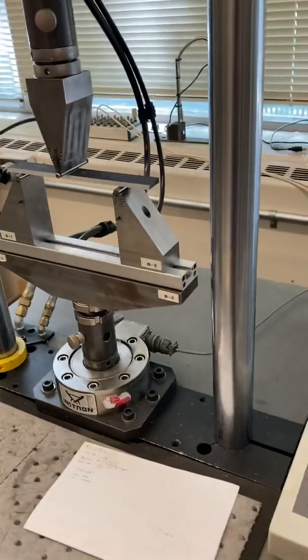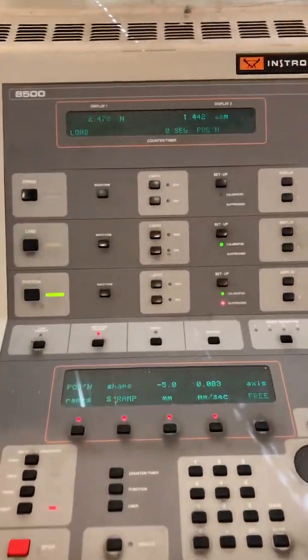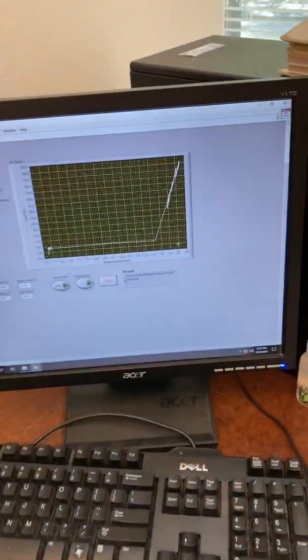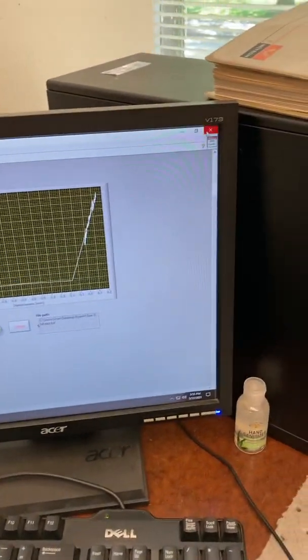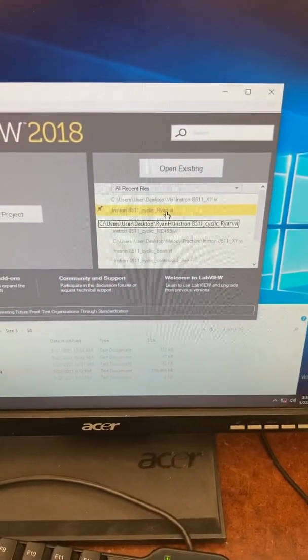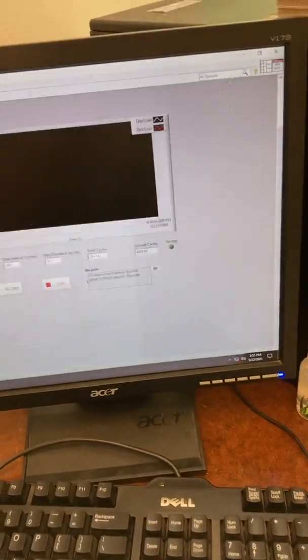I'm going to show you how to run a fatigue test. First, make sure we're in the correct user interface — this is the XY for the compliance calibration. Exit out of that and go to the Instron 8511 Cyclic interface.